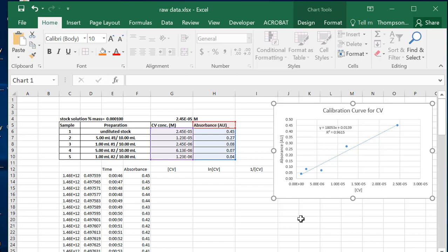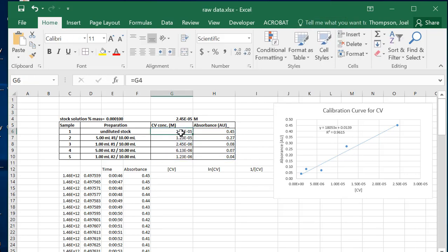But I'm going to just work the data, because what I really want to show you is how to let Excel do the work so that you don't make mistakes in the concentration dilutions, because that might have been what had caused this, but we know we didn't make mistakes because Excel did it for us. And we can read through and double check that.